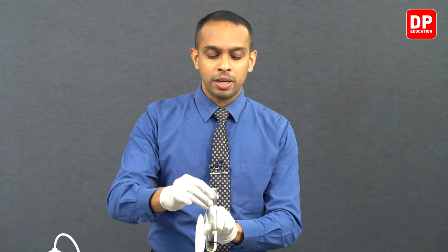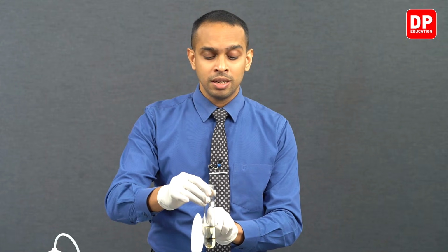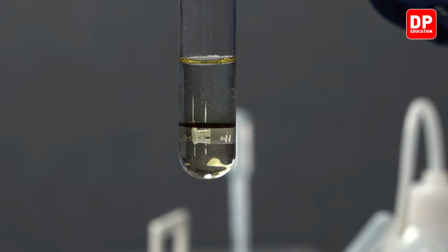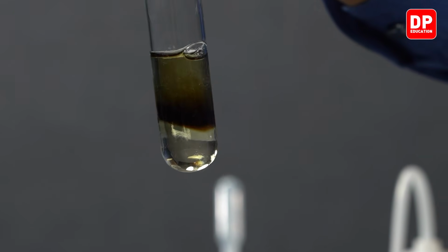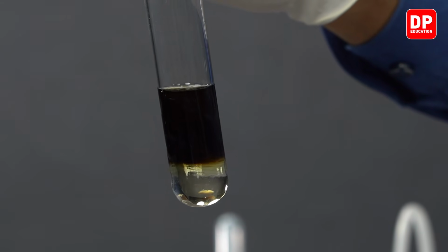So what will happen if I shake this? They very clearly mention don't heat this or don't shake this, otherwise this brown ring will disappear. So now I'm going to shake this. You will observe what will happen when I shake this mixture. You can see then the entire top layer is going to turn brown.